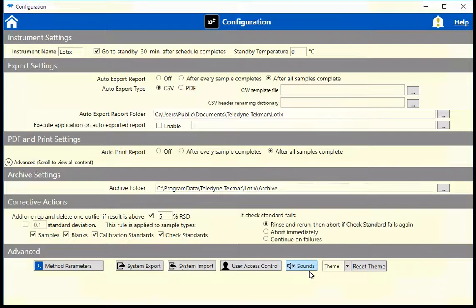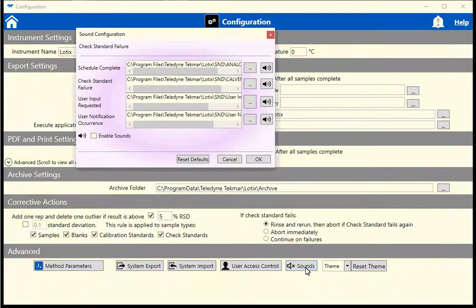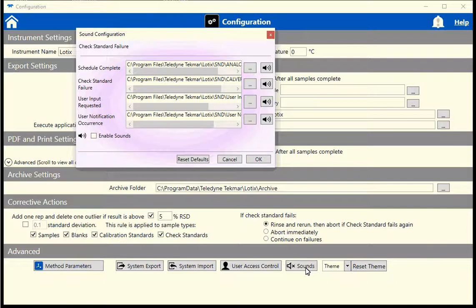Sounds or typed phrases can alert when the Lotix is done with certain tasks. This helps if you are in another part of the lab working and want to be able to check the results of the schedule. As soon as it is done running, you will receive an audio alert.